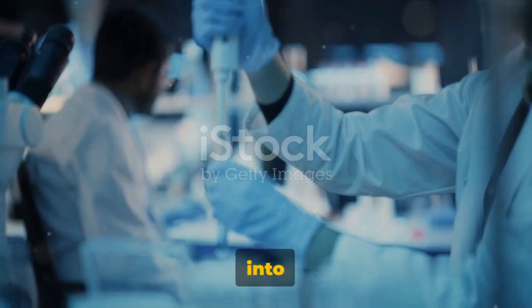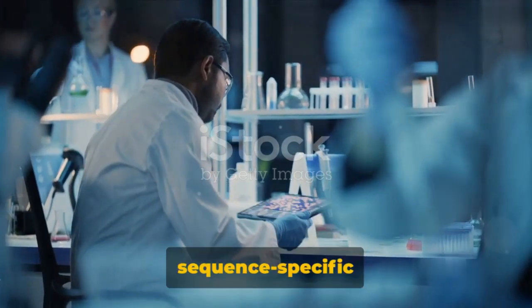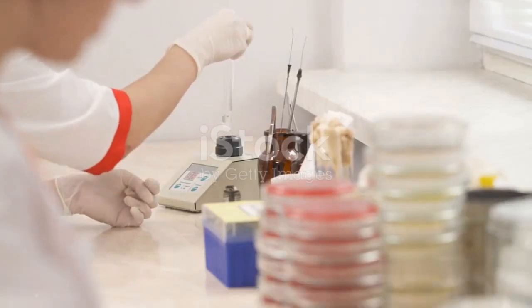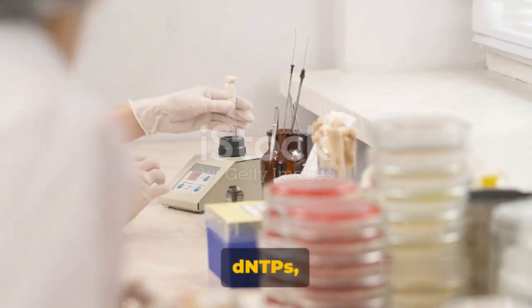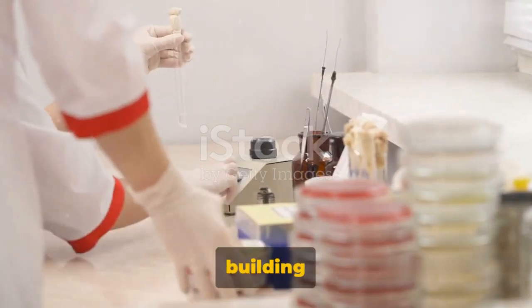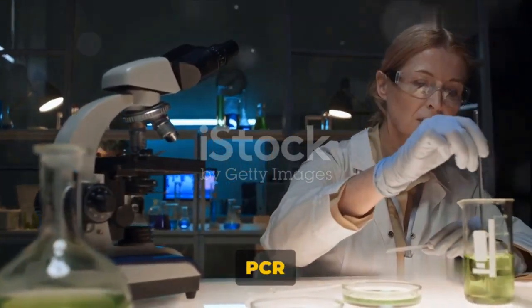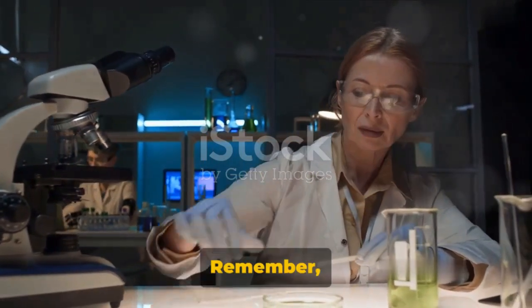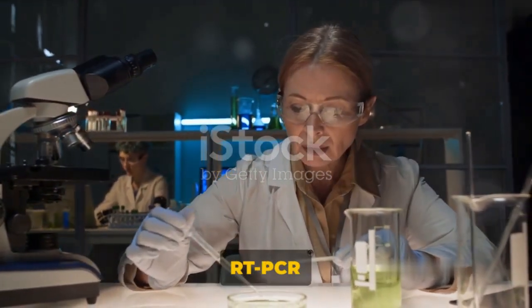We then delved into the 3 types of primers used in RT-PCR: random primers, oligo-dT primers, and sequence-specific primers, each with their unique roles in the process. We also touched upon deoxynucleotide triphosphates, or dNTPs, which act as the building blocks for cDNA synthesis. Finally, we covered the PCR buffers and other chemicals that are essential to the process. Remember, each component has a crucial role to play in the RT-PCR process.